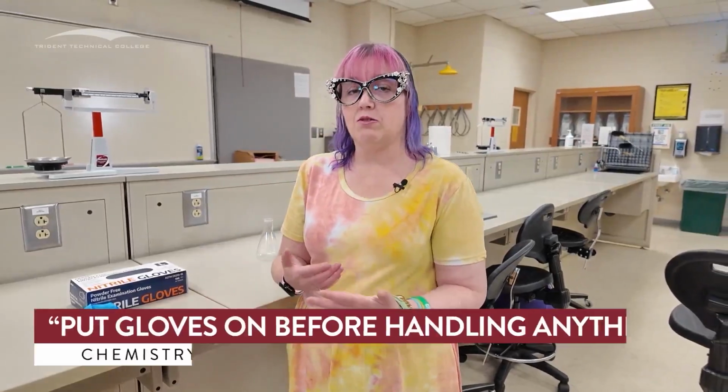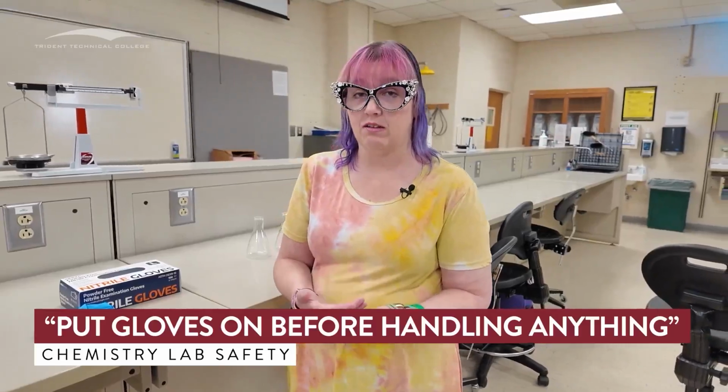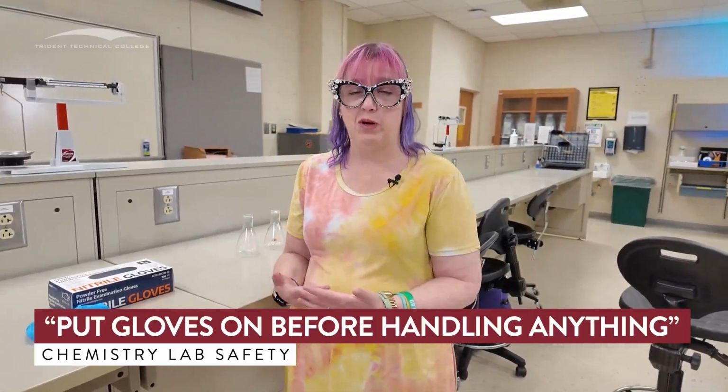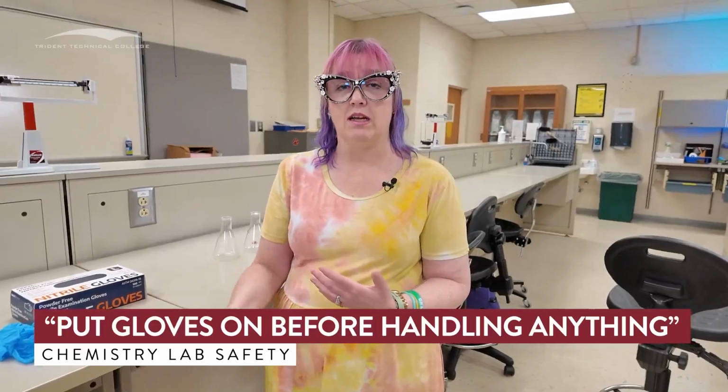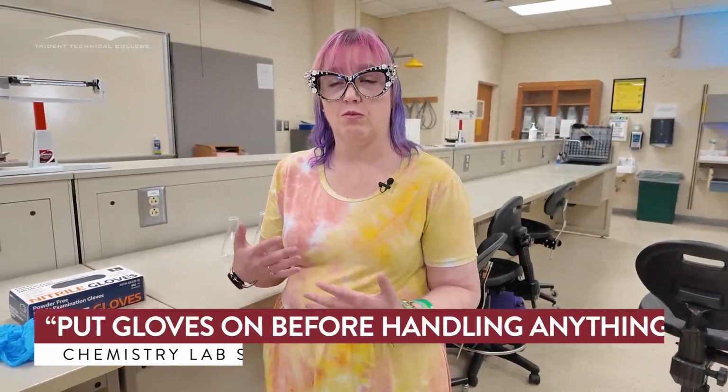Now, things that we need to make sure that we're dealing with when we talk about these experiments. We put those gloves on before we handle anything, because you may not be the first lab for that week. So the things that we're dealing with may not be as clean as we want them to be. So we want to make sure that we're dealing with everything in gloves. Anything that we deal with in the lab needs to be done that way. Anytime anybody is working with anything, doesn't matter if it's chemical or not, for those labs, we need to be wearing those gloves, okay?